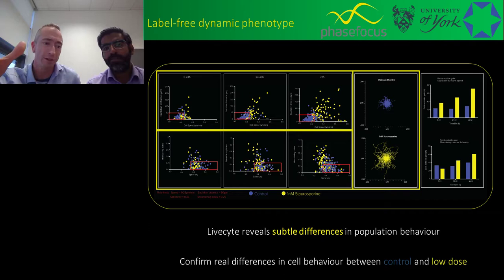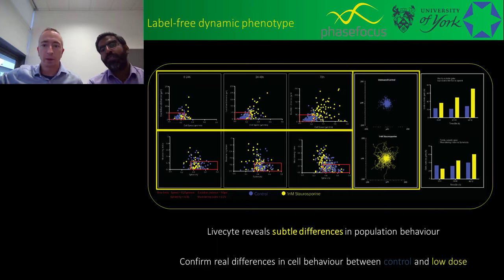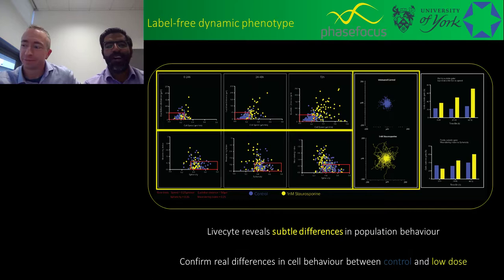Just to summarize on this slide, you would have missed that information on a standard dose response curve. In a standard dose response curve, we would look at the maximum effect of the drug, the IC50, EC50, but at the bottom of the tail of that dose response curve, there are actually things happening. This 1 nanomolar point would have been nothing to these cells.